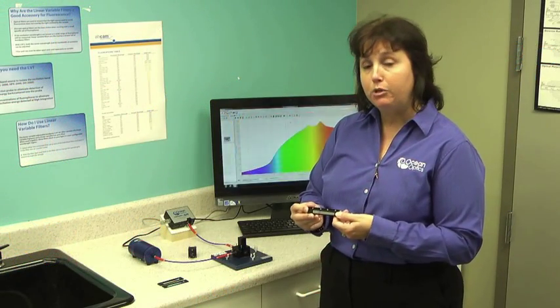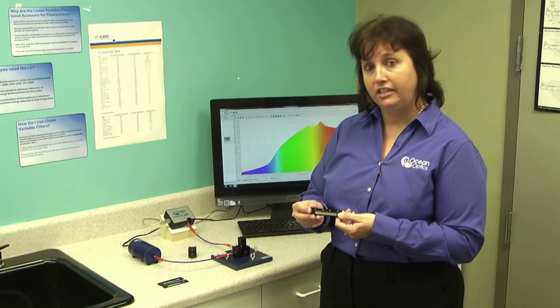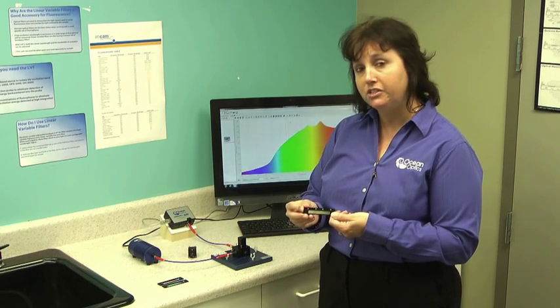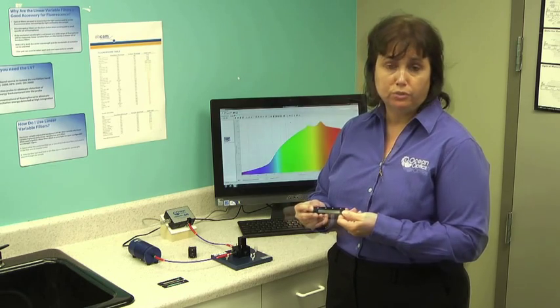They're a great tool anytime you don't know exactly what excitation wavelength you'll be using for your measurements, or when you're working with a range of different fluorophores.